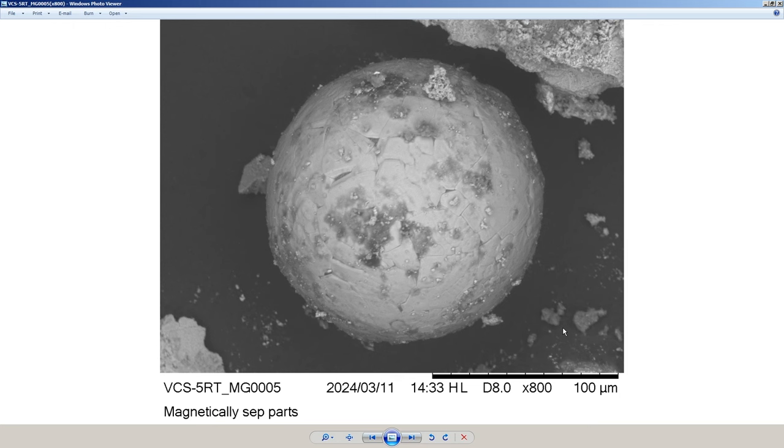That's Windows Photo Viewer, looking at this rather lovely iron-rich sphere. Oh yes, you can see the crenellations here. Beautiful. This means that the Bin-Juine Huang system, at least at this stage, is producing iron-rich crenellated spheres, and this is over 100 microns, so it's equivalent to the cavitation system of the original ultra experiments as conducted with aluminium by Alan Goldwater. So this has been rounded off, but you can see the divisions of the crenellations here and here, and maybe when we play around with this with a bit of contrast, those will bring out to be a little bit more clear.